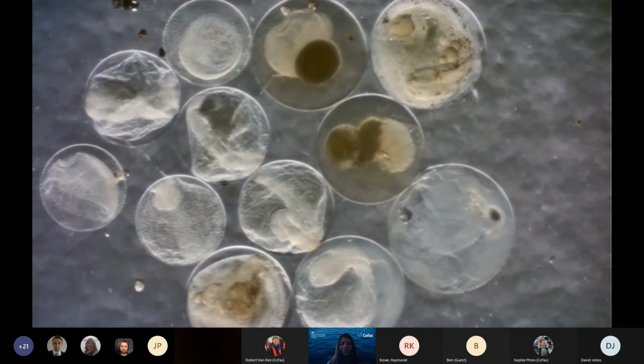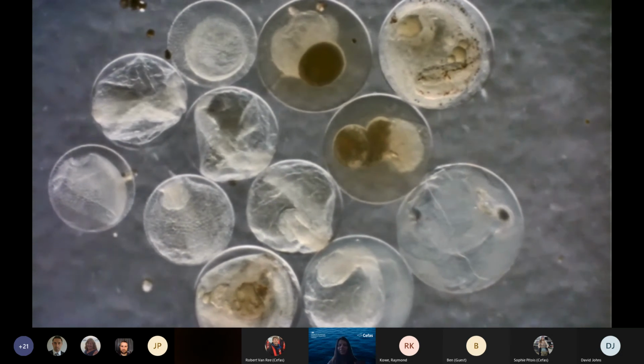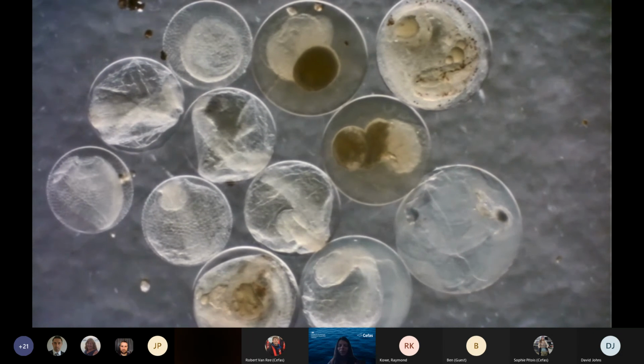But a lot of fish eggs can look very similar, however, and it's no easy task to determine the exact species for every fish egg we come across. Sometimes this can be achieved, however, by measuring the egg diameter and oil globule size, if present, and paying attention to the pigmentation of the yolk and even of the developing fetus. So in this clip, some of these eggs were identified from species such as mackerel and dragonette, which I think are these ones in particular.